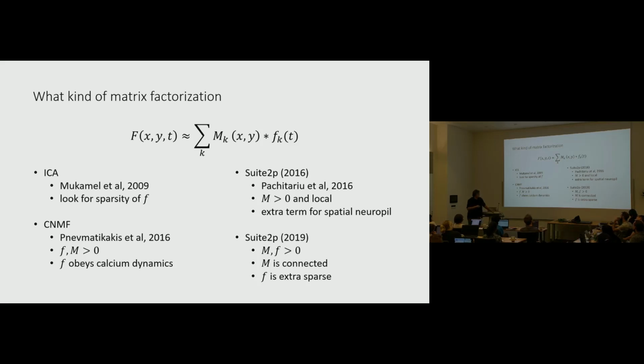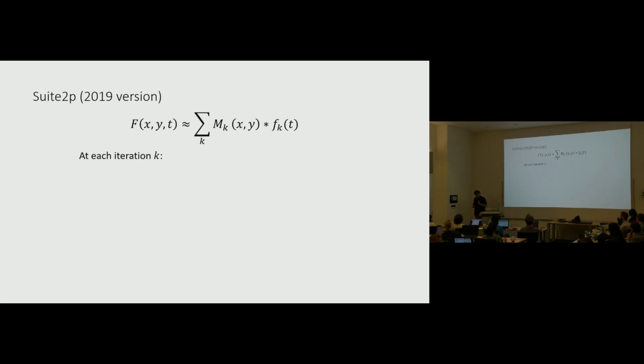So I already told you about one of the updates in this latest version. I should say that roughly the latest version of suite2p corresponds to the Python version, just because we've done most of these improvements after switching to Python. And the older version has also gotten some improvements, in 2017 and 2018. That roughly corresponds to where we left the MATLAB version when we switched over. And so we'll talk a little bit about this new algorithm, in the context of a step-by-step walk through the pipeline, through the cell detection part.